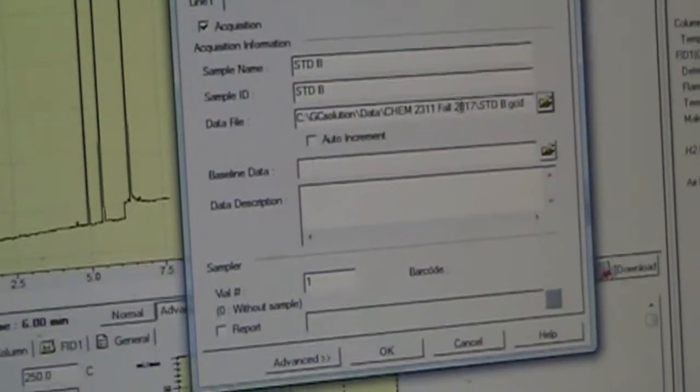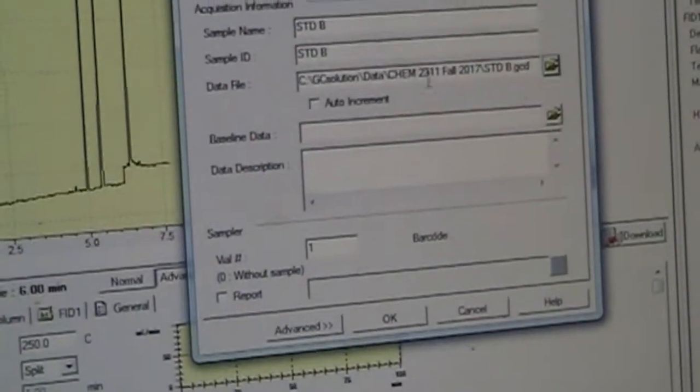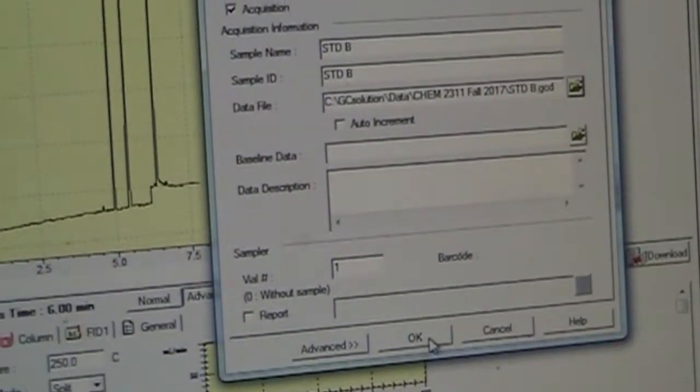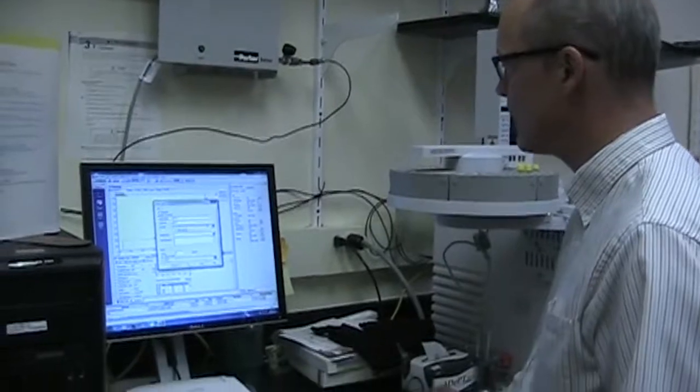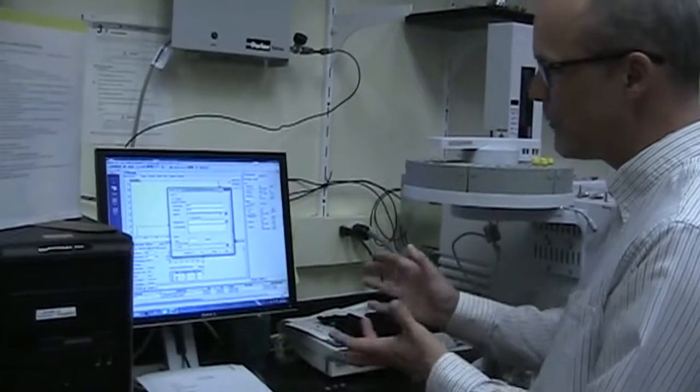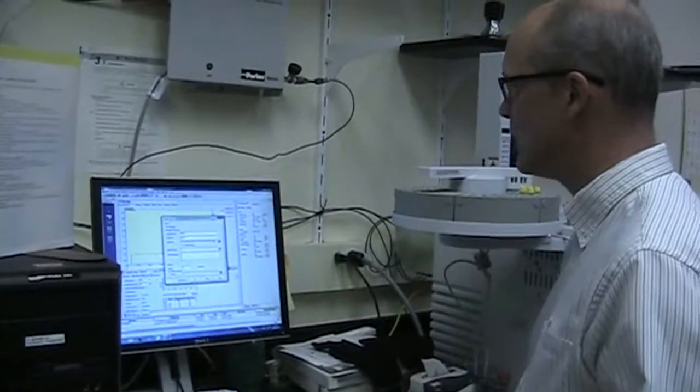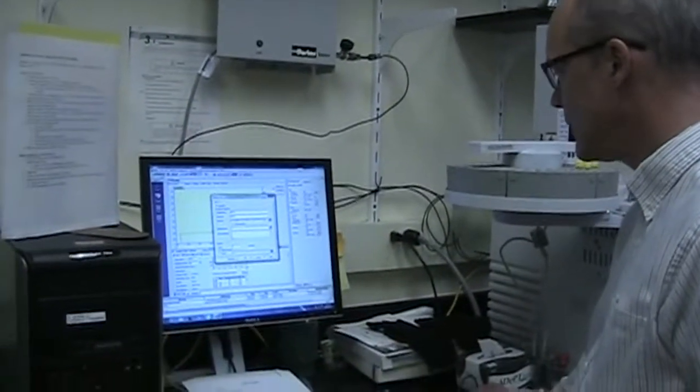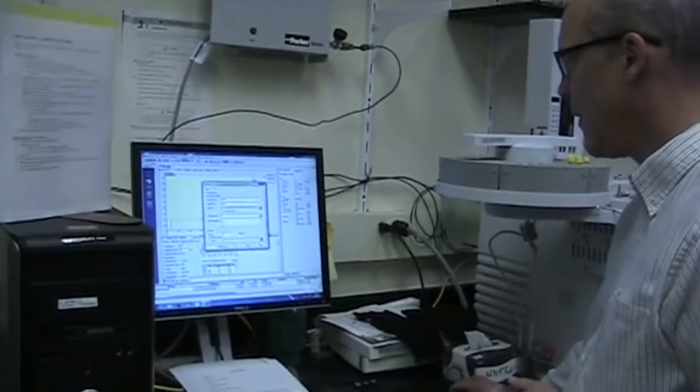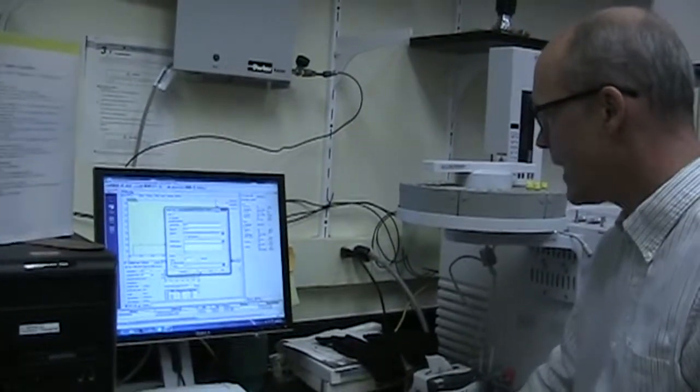Not real original here, but the sample name, the sample ID, and the data file are all going to just basically describe the sample. When you get to your actual samples, you can say aftershave, or bourbon, or moonshine, whatever the sample happens to be. So once you've entered those three things on the sample login, you simply say okay there.